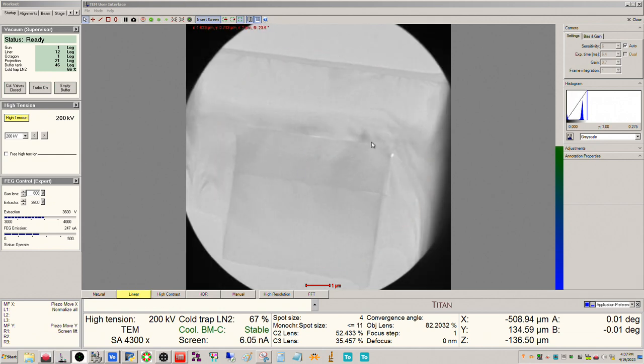So this material in here, it looks like a rectangle, but you can see it kind of gets curved toward the corners. So this is the active region in here. Everything surrounding this is pure indium phosphide. So this is the alternating layers of indium gallium arsenide and indium aluminum arsenide, which you can't really see at this mag. Well, actually, we kind of can here. I can kind of show you in a minute. But anyways, that's what this is, and this is the indium phosphide.